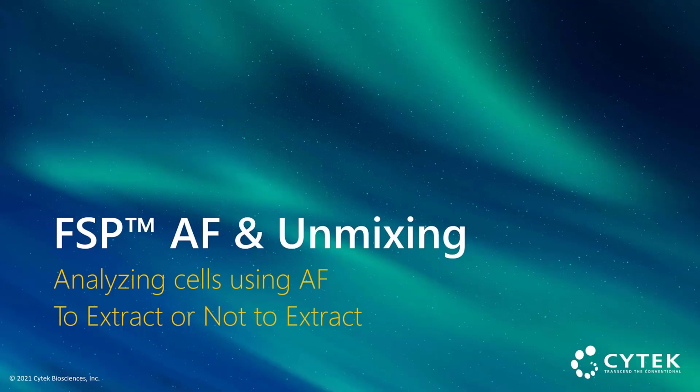Now that we have covered what the common characteristics of autofluorescence are, let's have a look at some case studies where autofluorescent properties of the sample have implications in how we analyze the sample and what we do when we're unmixing. When we're unmixing, we have 3 choices. We can do standard unmixing, which is something best suited to samples with low autofluorescence.